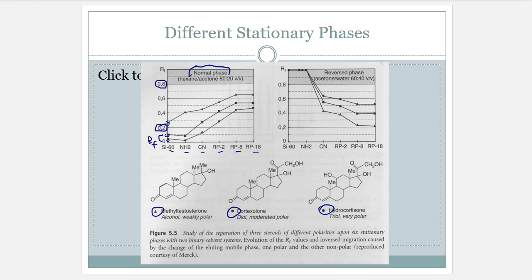So what we're seeing is that in our very first step, we actually don't see any improvement at all with 2 of the compounds. And then the third one will go up a little bit further. That's great. Okay, we're getting further away from the 0.2. That's good. That's where it was, actually. If we go to the nitrile plate, well, our first 2 separate, and one of them breaks over the 0.2 threshold. That is good news. The third one, if I look up at the top, has not reached our 0.8 yet. So that's great. It's just that first band, and I really want to be appropriate, and I want that to be above a 0.2 RF here.